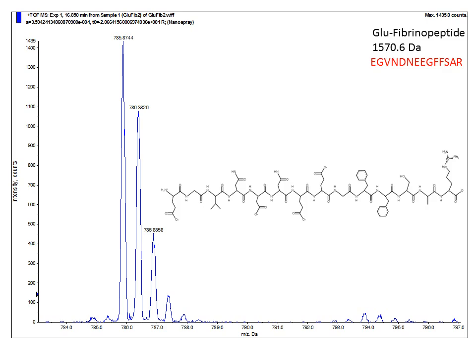Using electrospray, multiply charged ions are created, and peptides having multiple amines that can be protonated are at least doubly charged. As the mass spectrometer measures mass divided by charge ratios, the difference in mass between the C12 and the C13 isotope is half a Dalton for a doubly charged ion. This is used to select ions for fragmentation rather than have the instrument waste time fragmenting non-peptide ions.